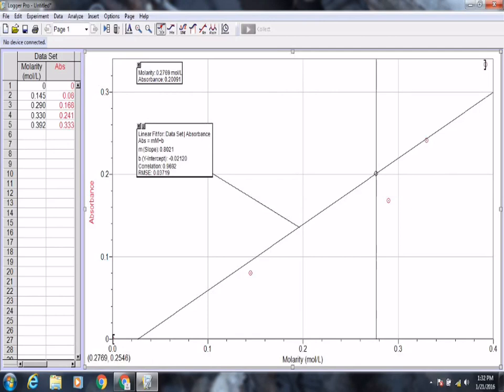Let me know if you have any questions about how to print this, but I'm pretty sure if you're careful, the way I figured it is if I take my interpolation thing and kind of go off the graph and bring it over, I can actually print that graph. So if you're careful how you zoom up and go over, that's how I kind of tricked it.